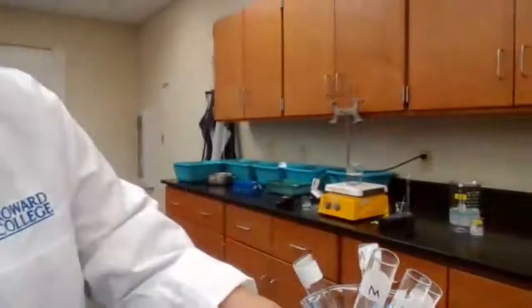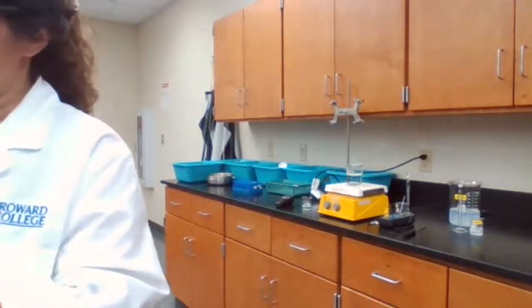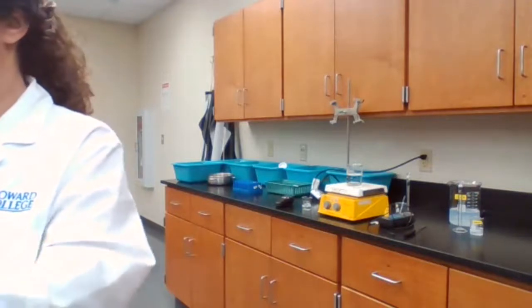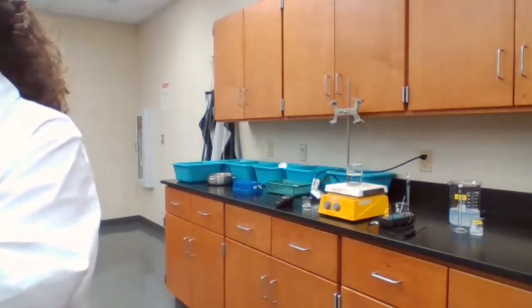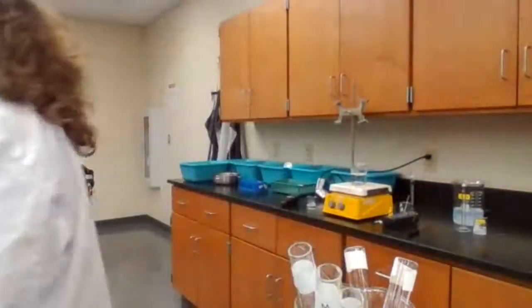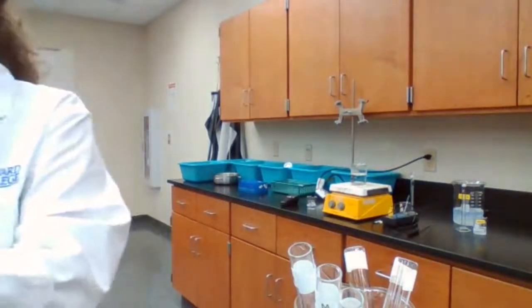We are going to keep the temperature constant, and in order to do that, we should keep these test tubes in a beaker of water, so the temperature doesn't change, because we are not doing anything for the temperature of the water to change. Is the water at room temperature? I have to first take it to the fume hood, get the HCl in and bring it back here for adding the magnesium.